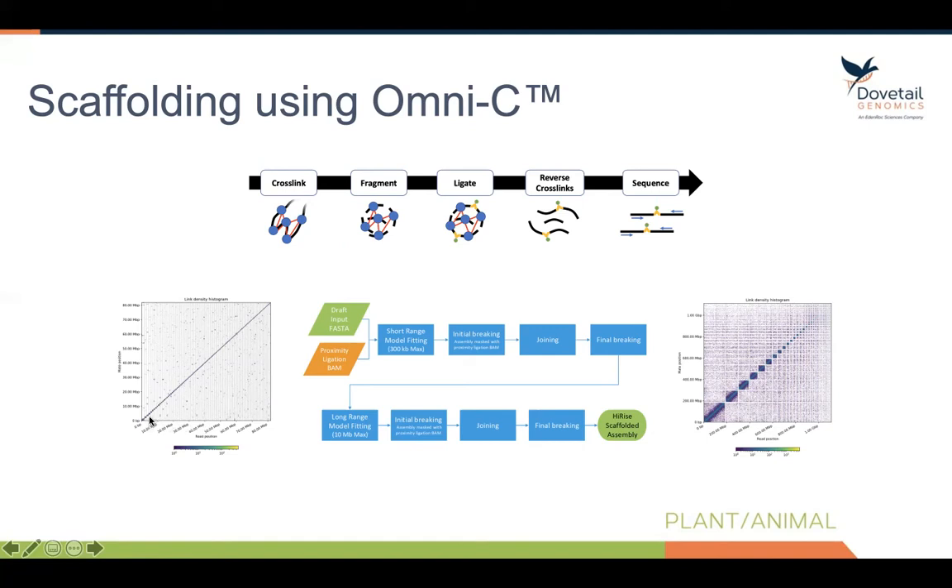I like depicting this with actual raw data from our Omni-C. Here you can see a contact plot from an assembly before it goes into the HiRISE pipeline. Along the diagonal, you can see thousands of little squares — each one of those squares is a separate scaffold. This assembly would not be very useful because the contiguity is far too low. After we scaffold this genome assembly using Omni-C, we get the result on the right.